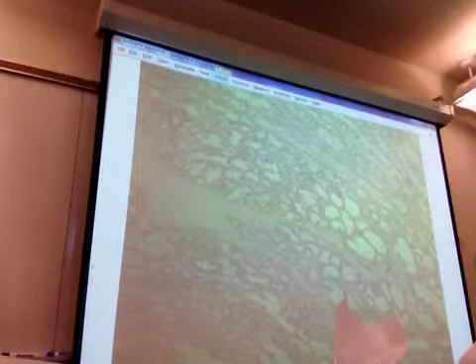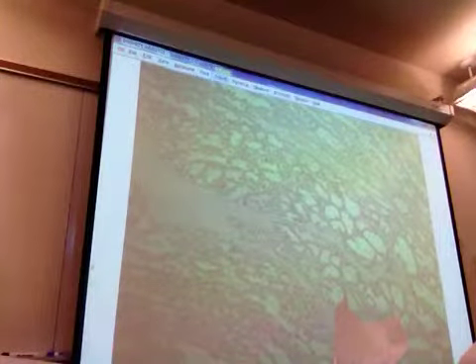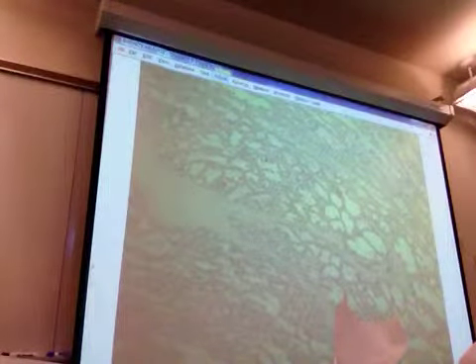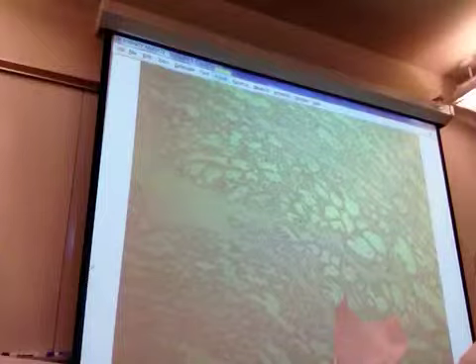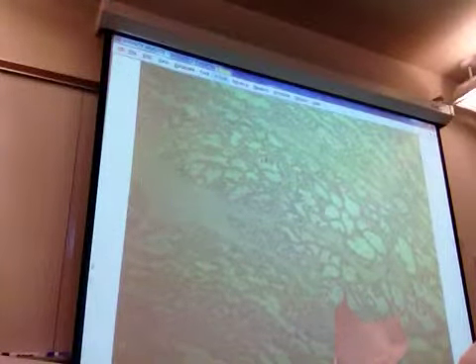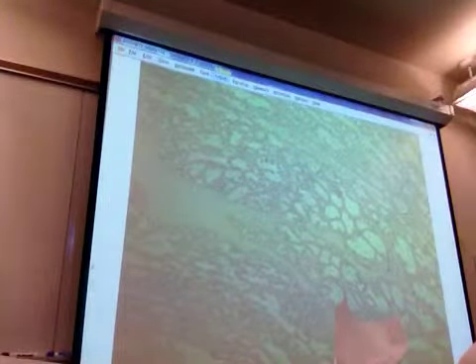And then is there any other things you could see in there? Well, other than the glands, the pockets, no, not really, other than basically the different septa. You can see the prostatic urethra. Well, not in this slide. There's no urethra on this one. What are those areas, are those called septa? I think they're septa, yeah, and I think that the prostate has a capsule, too. Yeah. But we don't have capsule on this slide, but you do have septa.